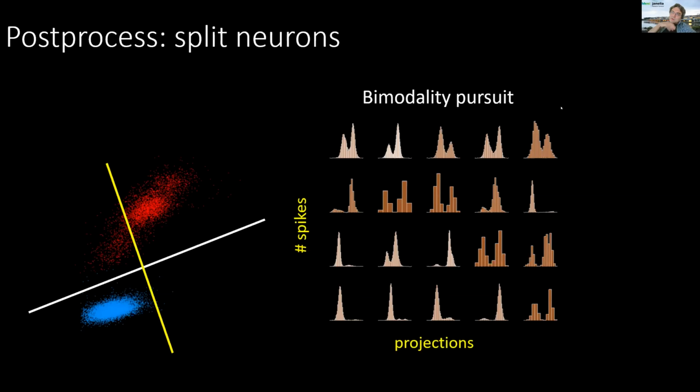It's not just that the quality of the recording was bad, but also that drift correction works really well when you have a long probe like the NeuroPixels probe, and you are sampling different parts of it throughout the length of the probe, so that you can tell if something moves up and down based on having all those reference points. Now, if you use it in such a way that you're only recording from a fairly short segment, or maybe you're not using a NeuroPixels probe, but you're recording from a short segment, you don't have enough vertical spacing to do a good inference of the amount of drift. That's where I've seen it fail.